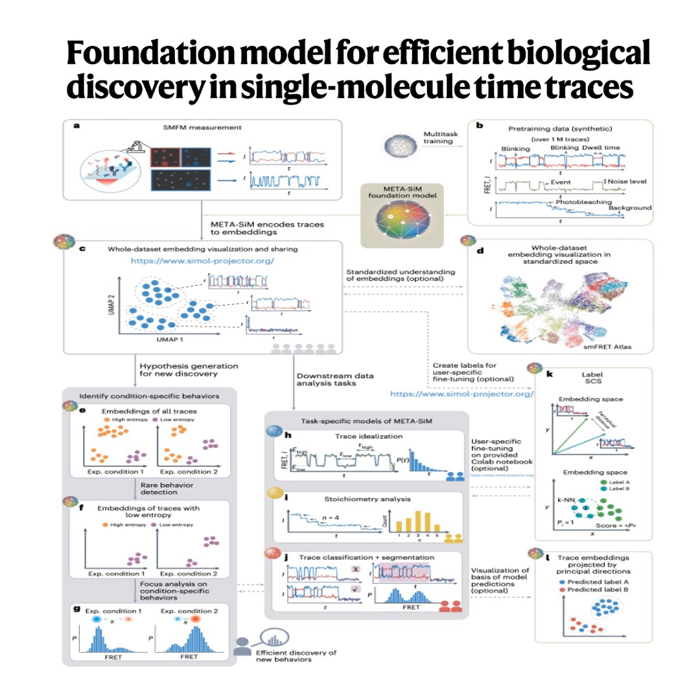This is the part that sounds almost too good to be true. You mentioned minimal fine-tuning. What does minimal actually mean in practice? It means sometimes needing as few as, say, 100 labeled examples from the user's own experiment to get high performance. Just 100, compared to potentially thousands or tens of thousands you might need if you were training a deep learning model from scratch for that specific task. We're talking maybe a 10-fold, even up to a 100-fold reduction in the amount of labeled data required.